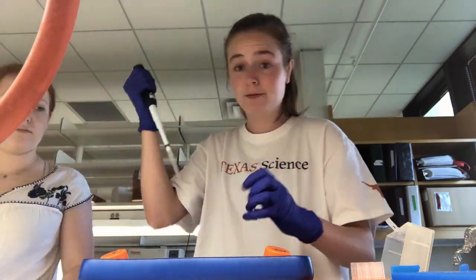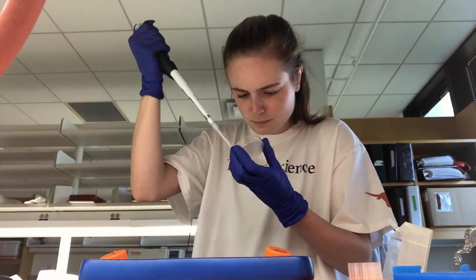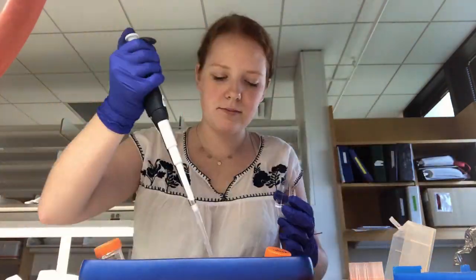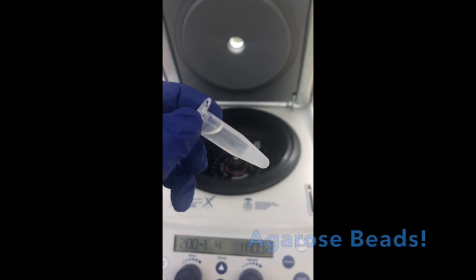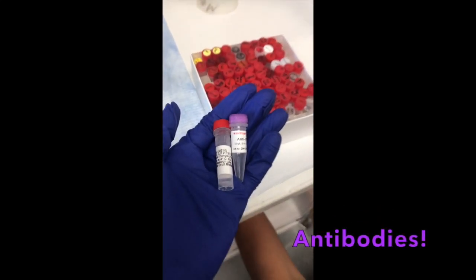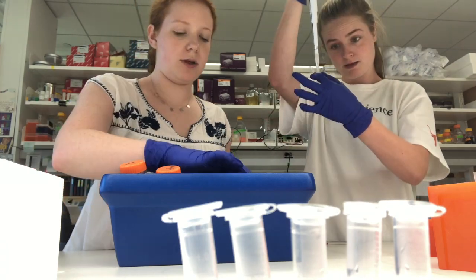First, we lyse our cells to break them apart and access all their proteins. Then we conducted a series of washes to pre-clear our cell lysates and to rid the agarose beads of their buffer solution. We pipetted the beads and two different antibodies into each lysate. The antibodies bonded to our proteins of interest and the beads attached to the antibodies.